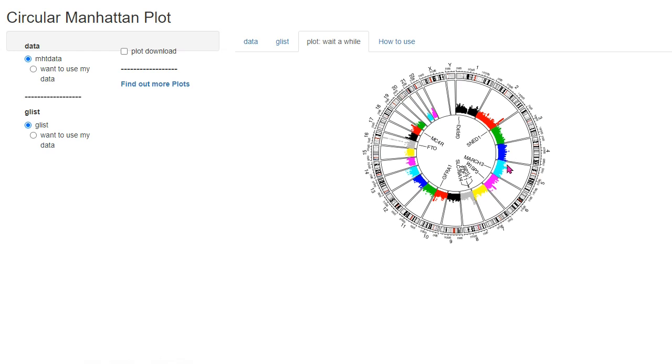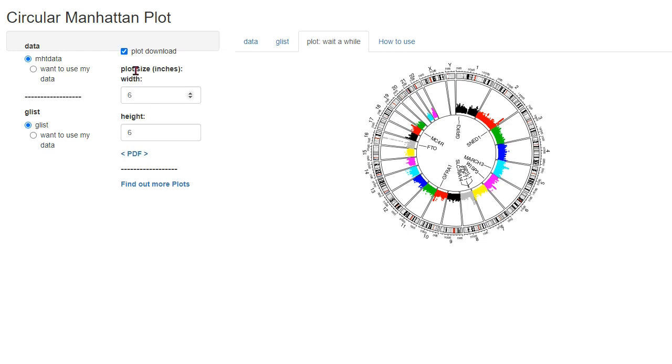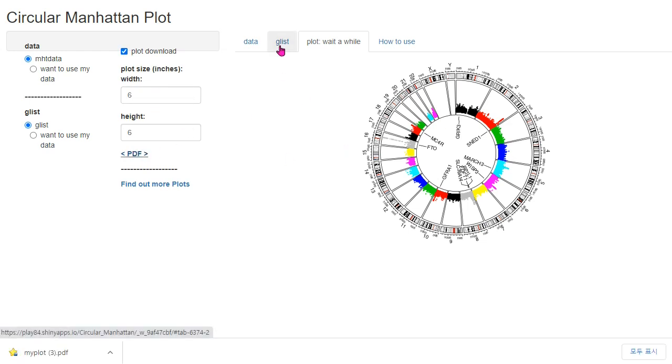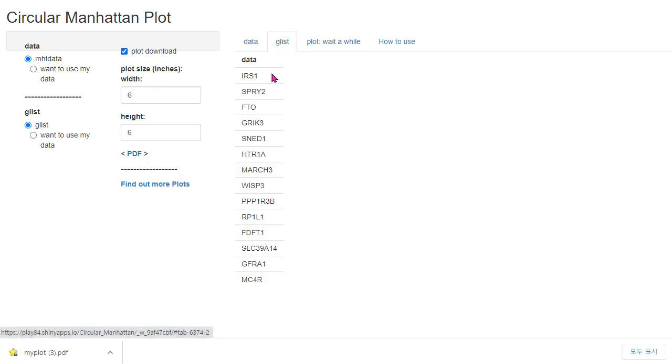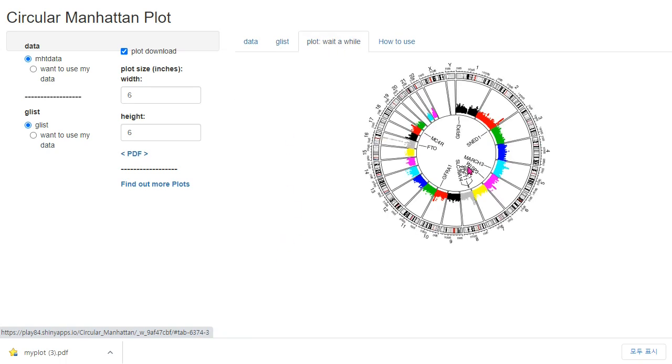Here it's very small. If you want to see precisely, you can download this plot as a PDF, and this information, the list of the second file, is shown in this area.